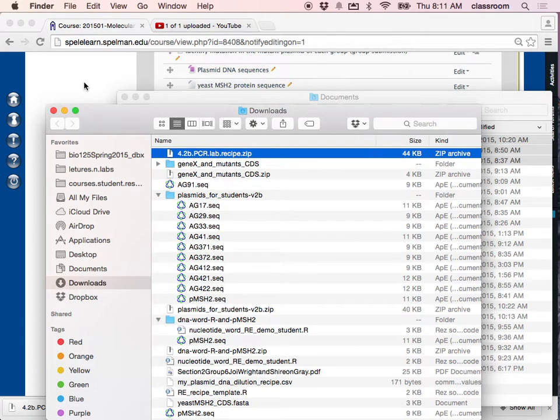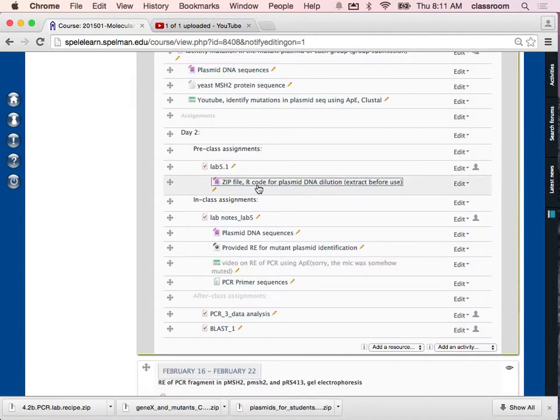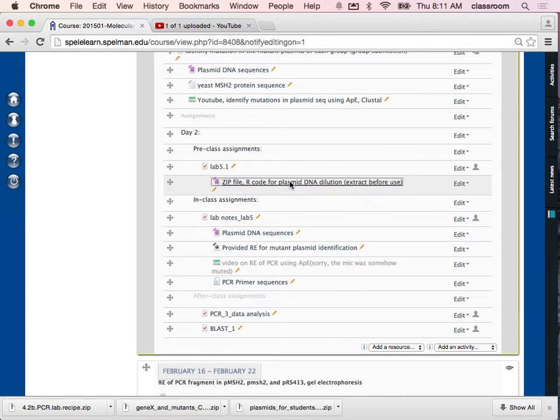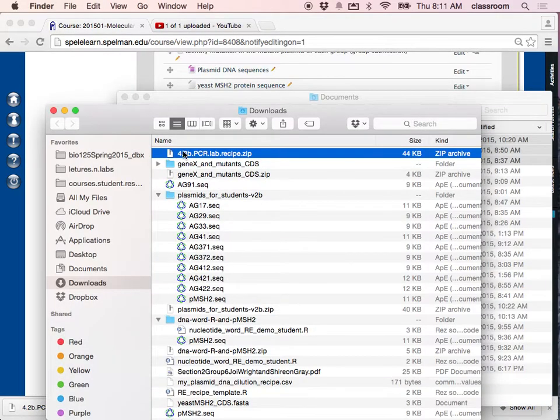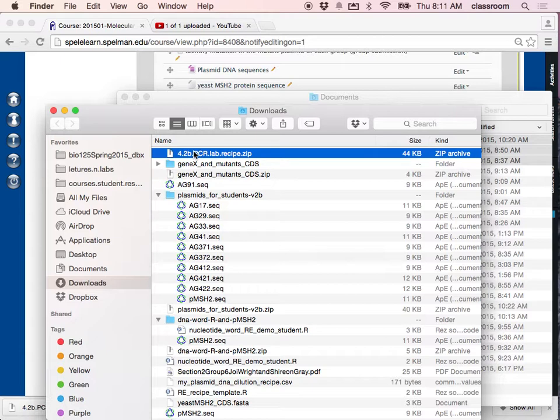I made the PCR template dilution recipe. So I gave an R code which is in a zip file. And you need to download that and then extract it. This R code must be extracted before you can use it.